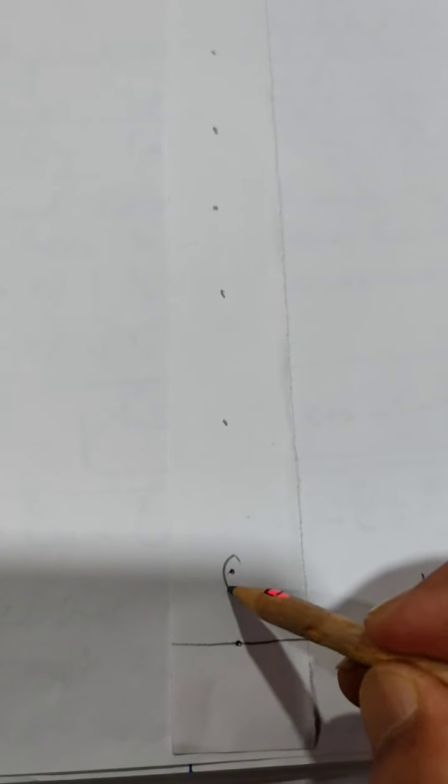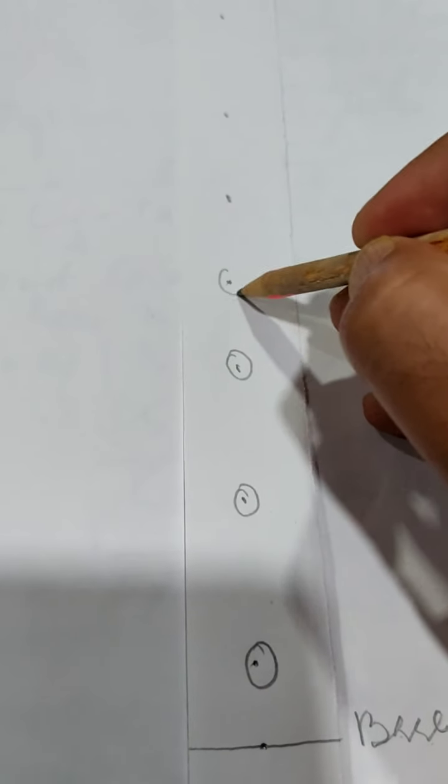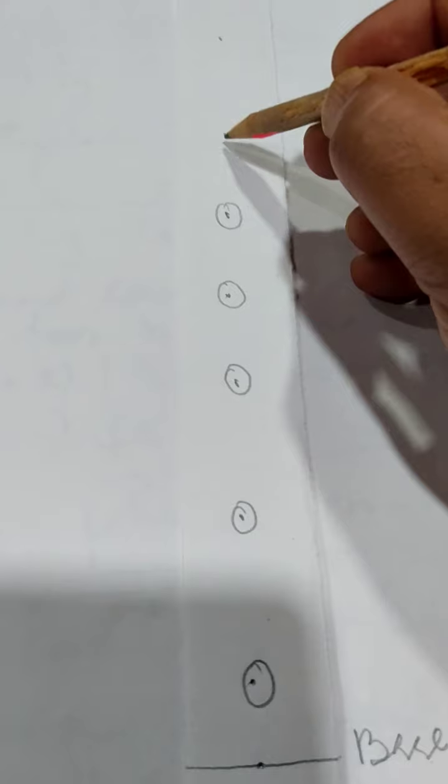While we dry it, we see that there are different spots. Some spots are here, some here, some here, and some here. All these ingredients that the mixture contained have undergone segregation, and we mark these points with circles. As I told you, it's not always necessary that all the spots will be visible, but we make them visible by spraying the chromatogram with some indicator solution or spotter.